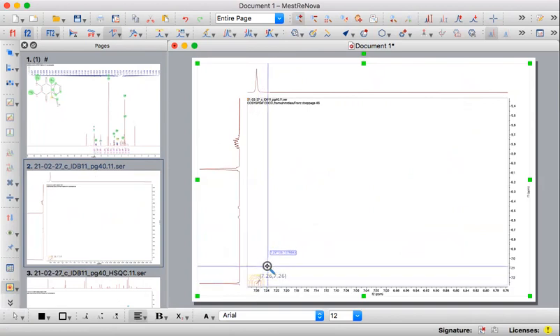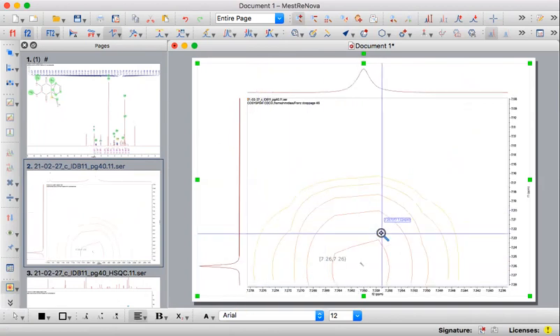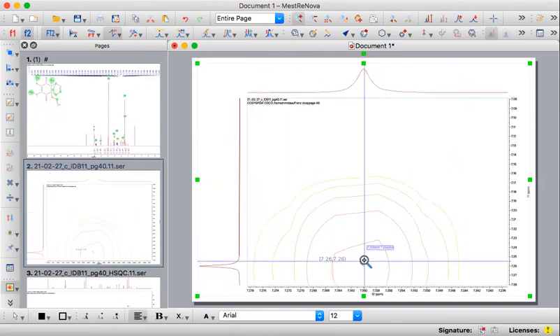And right down here is our chloroform signal. It is almost right outside of our spectral window. So this experiment could have definitely benefited from a larger spectral window, but we can still see that chloroform signal and we can appropriately reference it. So it's going to automatically lock in.